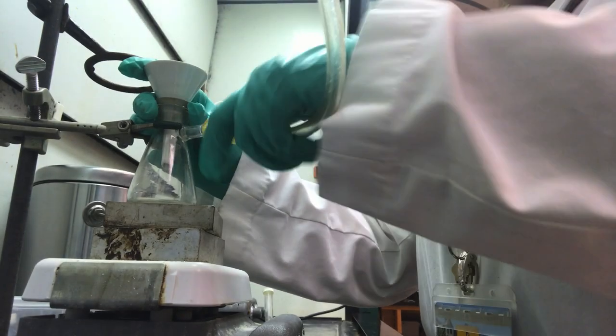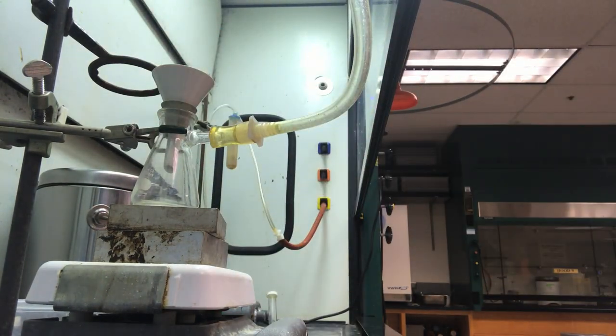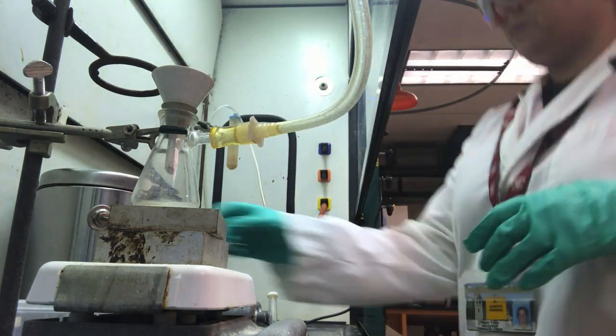The Hirsch funnel should be properly hooked up to the trap in the hood using Tygon tubing. A filter paper is placed in the funnel and rinsed with DI water.